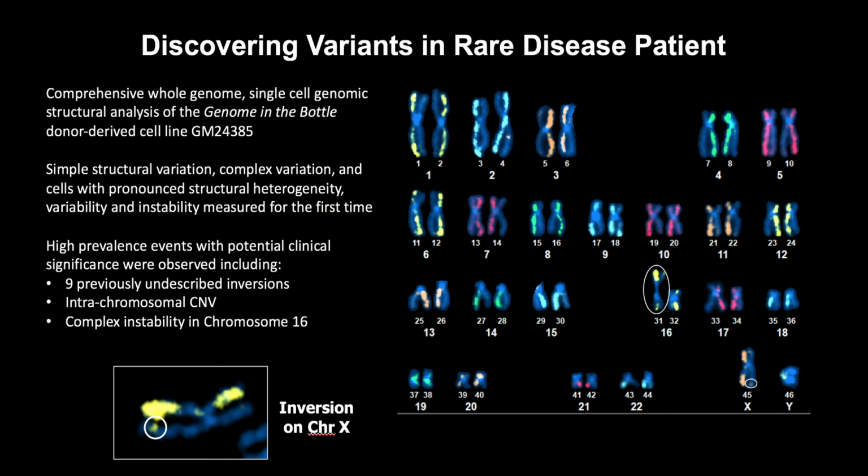The development of this whole genome screening method is being funded in part through small business grants from the U.S. government's National Institutes of Health, specifically through the National Center for Advancing Translational Sciences, as well as the National Human Genome Research Institute, which originally funded much of the sequencing of the human genome. Through this support, these NIH Centers of Excellence have acknowledged the value of a complementary orthogonal measurement of structure like DGH in applications ranging from cellular engineering, undiagnosed disease drivers, biodosimetry, and oncology.